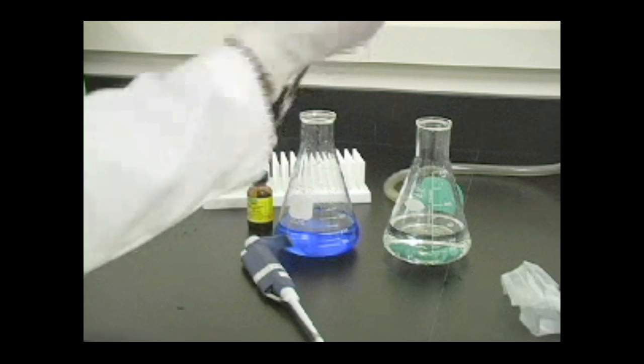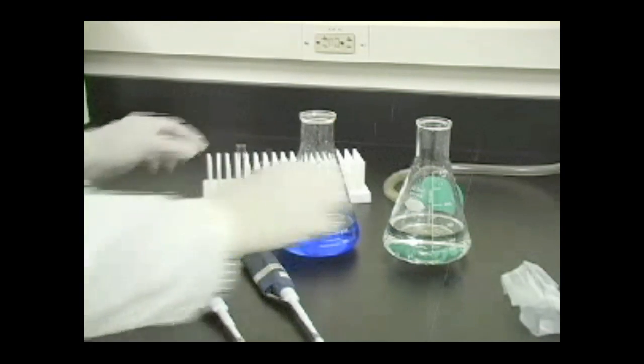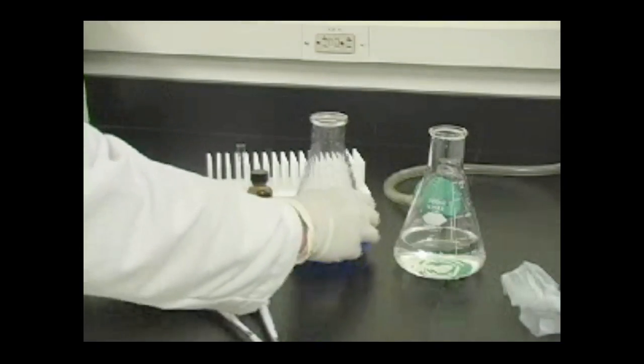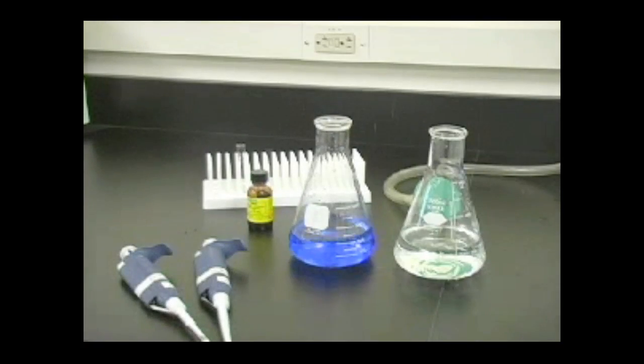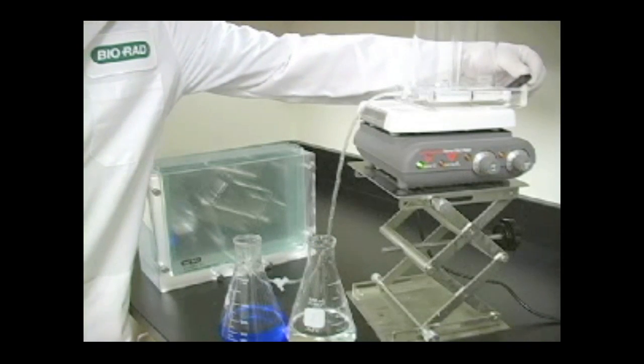In this video we have artificially colored the heavy solution blue so that you will be able to see the gradient forming. Be aware that your heavy solution should not be blue. Make sure to swirl the solutions to ensure the initiators are evenly incorporated into the monomer solutions. You now have about 10 to 20 minutes to complete the rest of the casting before the acrylamide begins to polymerize.